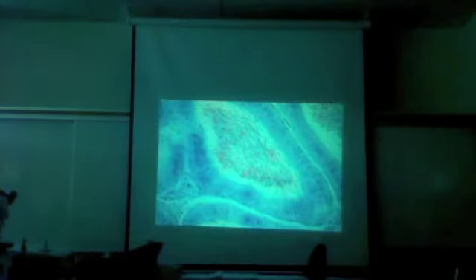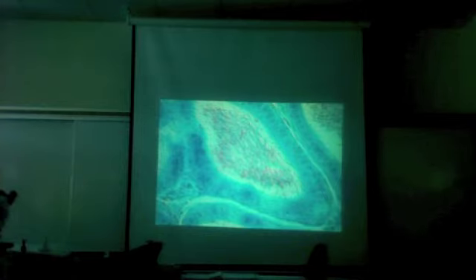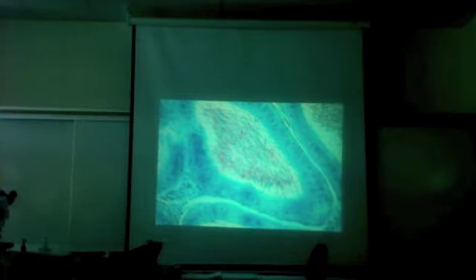Where are we again? Seminiferous tubule in what organ? The testis. And blah blah blah. All right. And then what is this area? What are all these? Sperm with tails. So we know we're not in the seminiferous tubules because there they were just getting the heads made and got the tails. So now they've moved into the epididymis and the sperm there with all the tails ready to go. Okay.